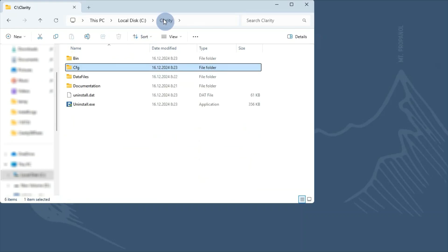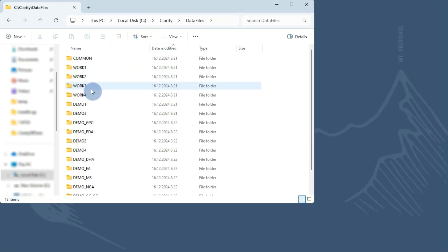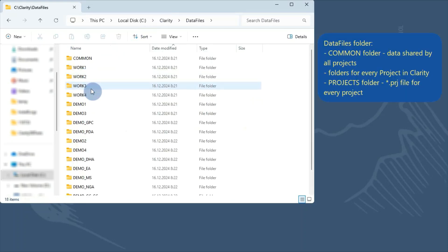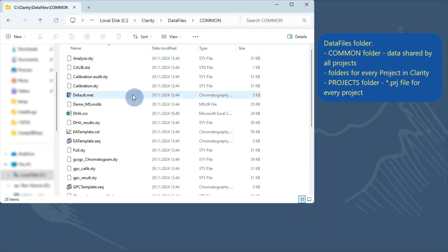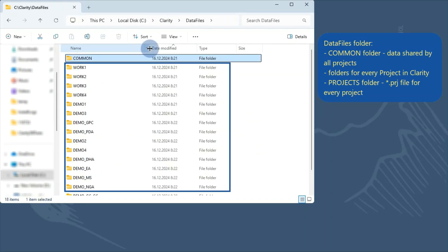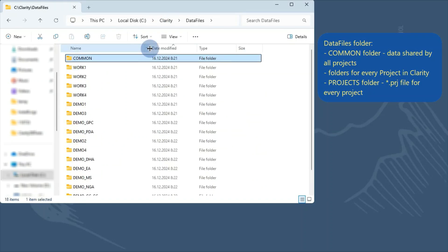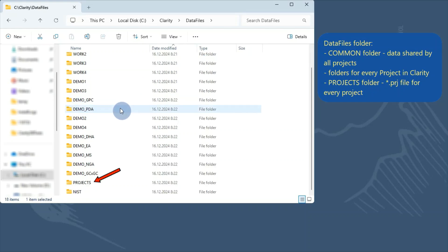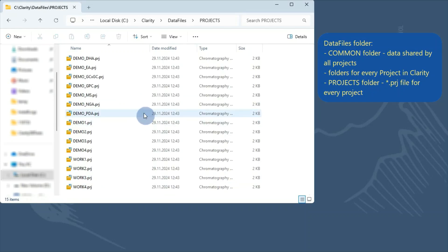Now, I will show you the structure of the data files folder. Clarity uses a project-based structure, so in the data files folder you can find a common folder that contains shared files for all projects like report styles or templates. There are also folders for every project, and a Projects folder that contains individual project files corresponding to each existing project.